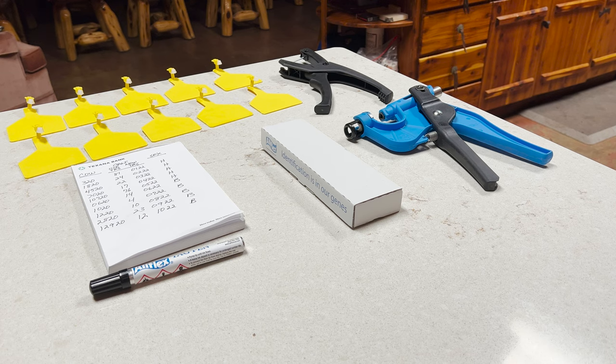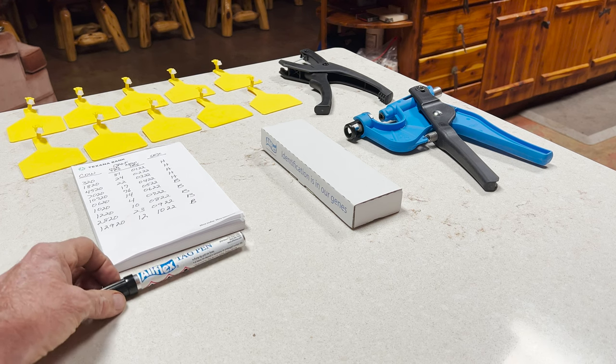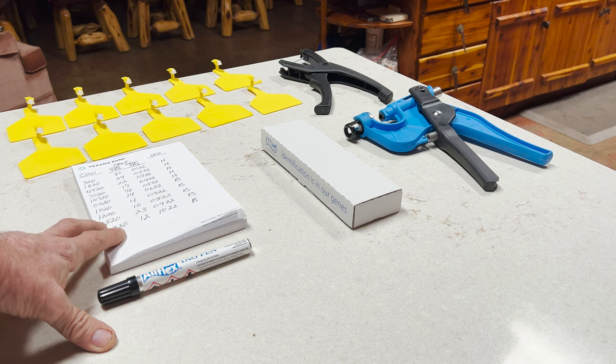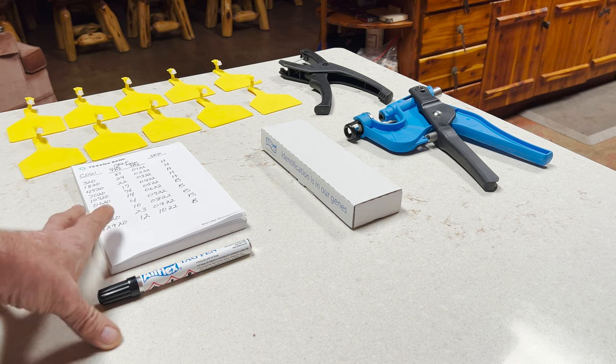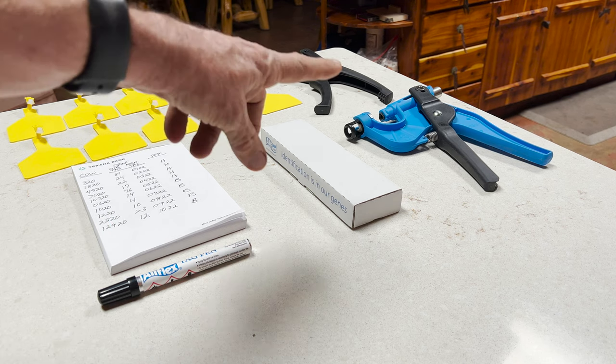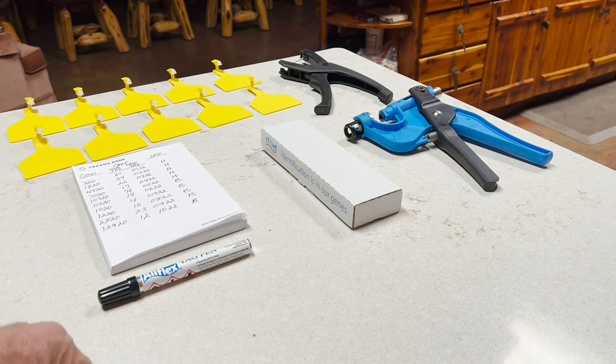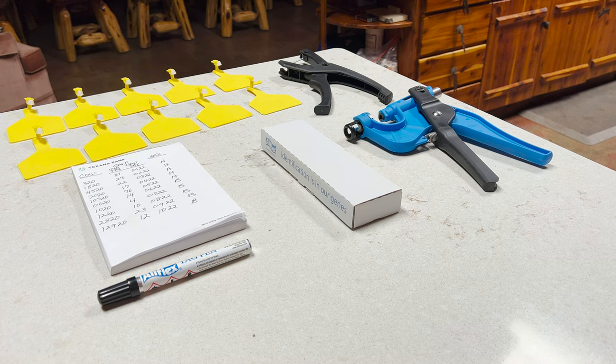So we've got ten calves to register. You can see I've laid out ten blank tags. I've got a marking pen to write on the tags, a list of the cows and calves with their old and new tag numbers, the tagger for the Z tags, the DNA sampling gun, and the tubes that the sample goes into so we can send it to the lab and identify the sires. Stay tuned as I show you this process.